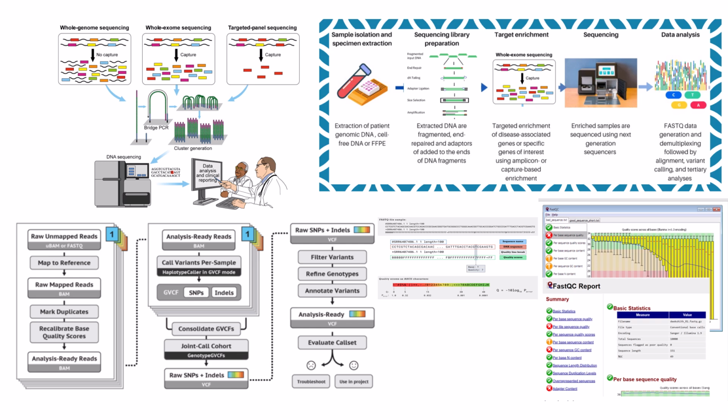So this whole phase is all about refining that raw data, making absolutely sure it's trustworthy before we attempt the really deep analysis. Okay, makes total sense. Data's cleaned, it's trustworthy. Now comes, I guess, the really big computational step. Figuring out where each of those millions of cleaned up patient DNA fragments actually belongs on our reference map. This is phase 3, mapping: genome alignment and post-alignment processing. This is where the puzzle pieces really start coming together.